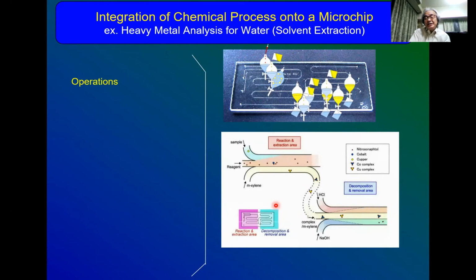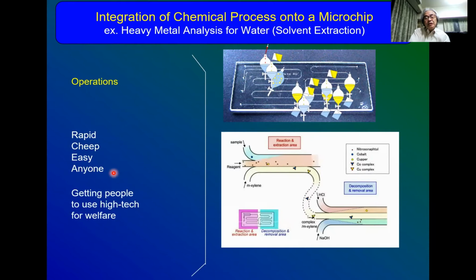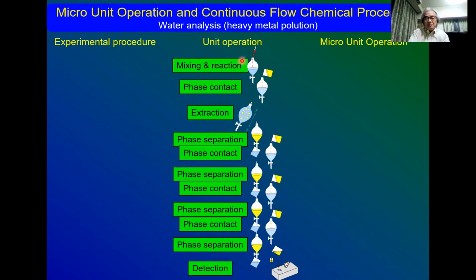This is microfluidics. And the merit of microfluidics is that it is rapid, cheap, and easy, and anyone can operate it. It's something very similar to the semiconductor, and so they're getting people to use high-tech chemistry for welfare. And then, as I told you, this is the procedure of the water analysis.